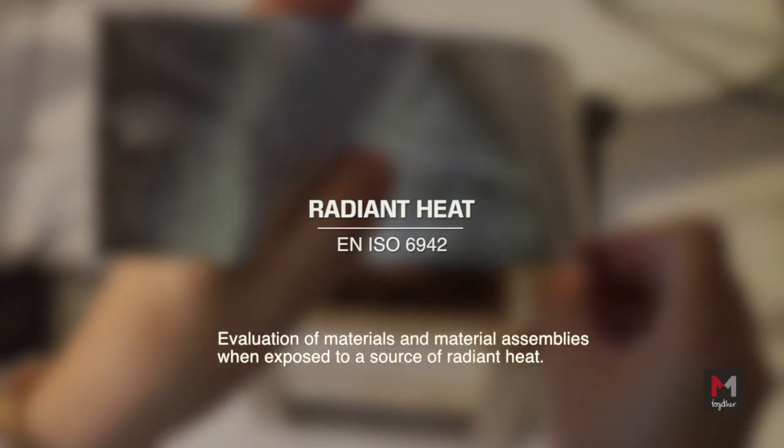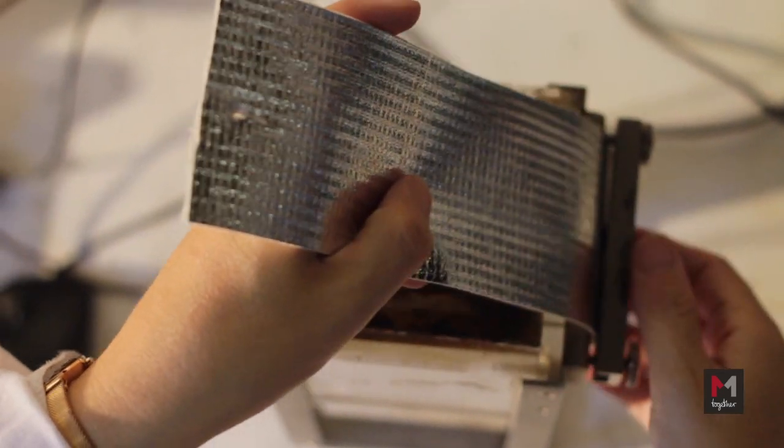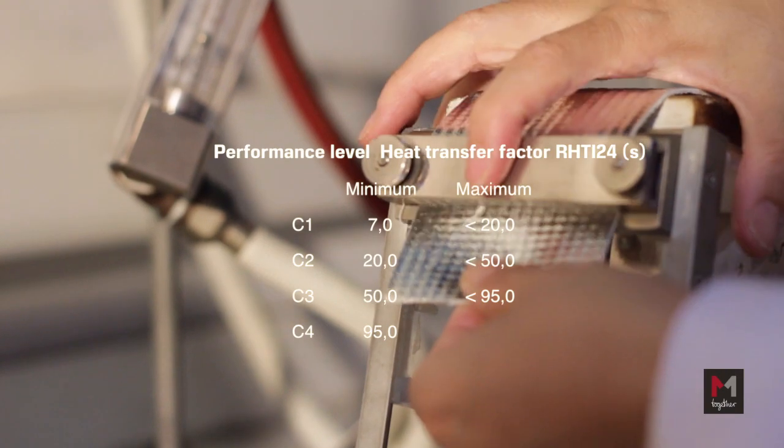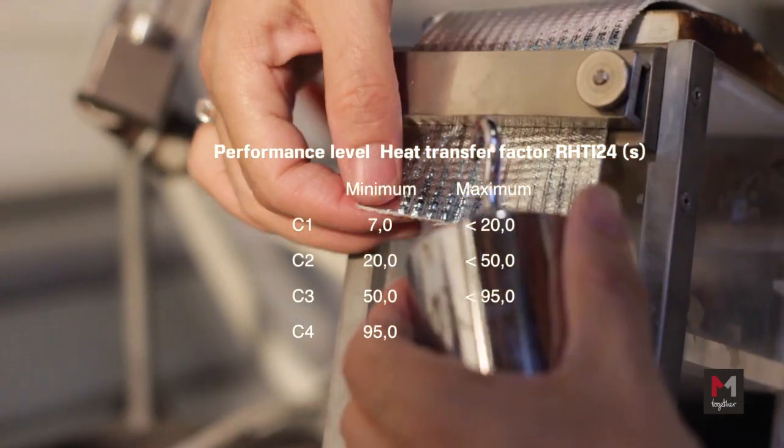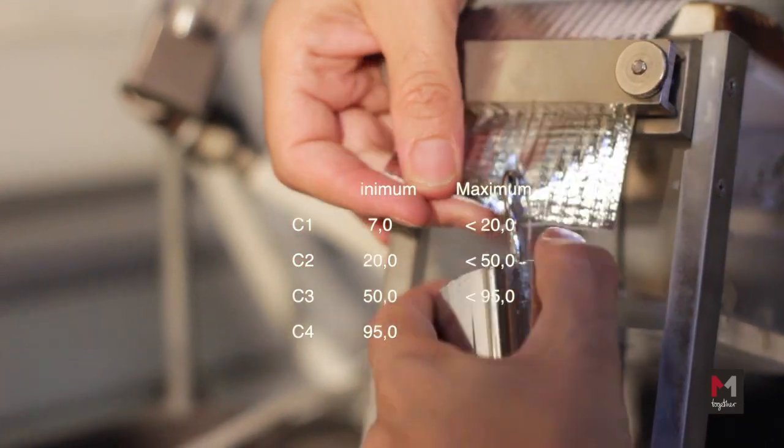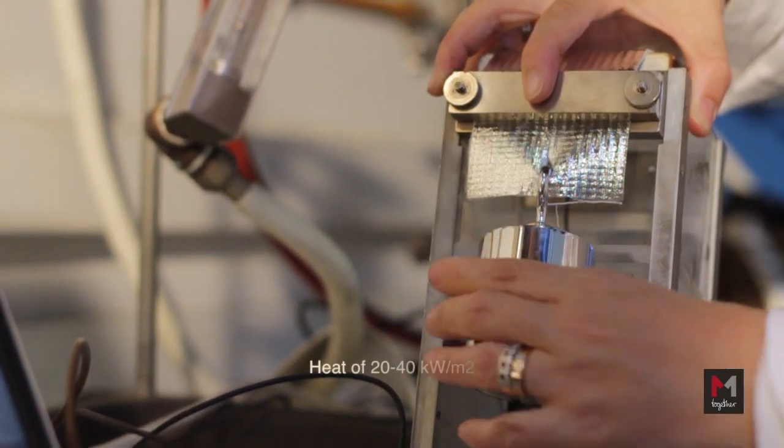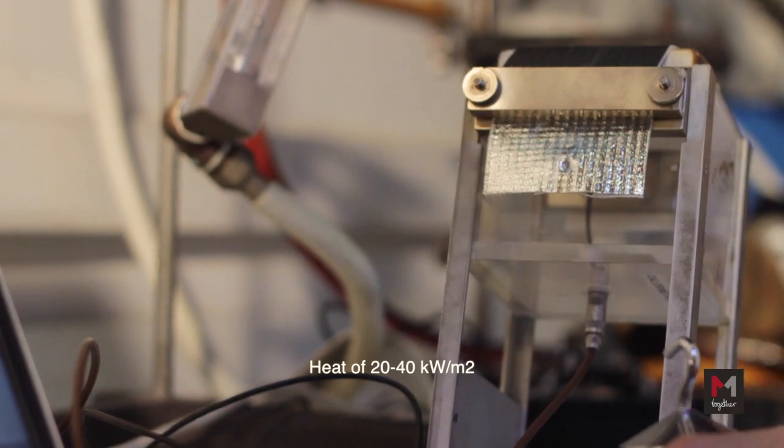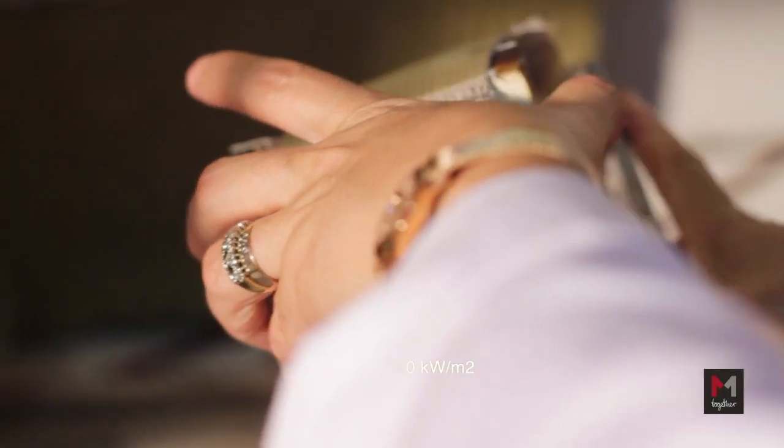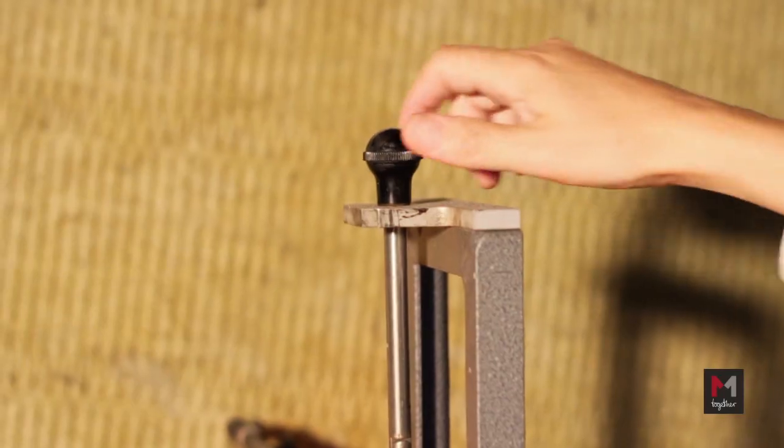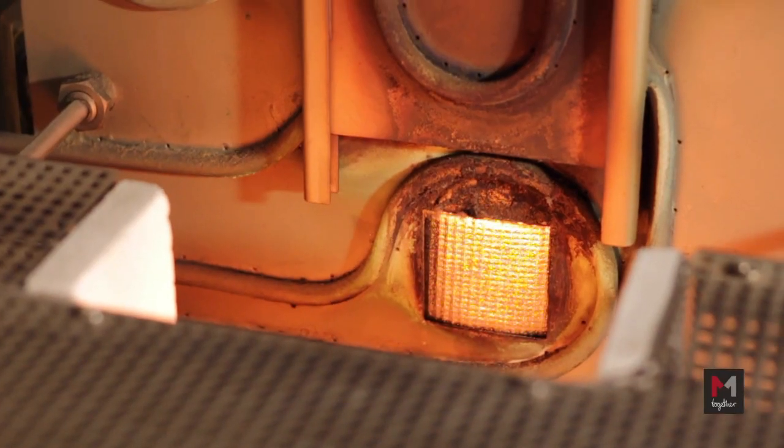Radiant Heat: For each material or set of materials at least three specimens shall be tested, 230 millimeters by 70 millimeters. Test Method: The specimen is subjected to an incident heat flux of radiant heat of 20 to 40 kilowatts per square meter.